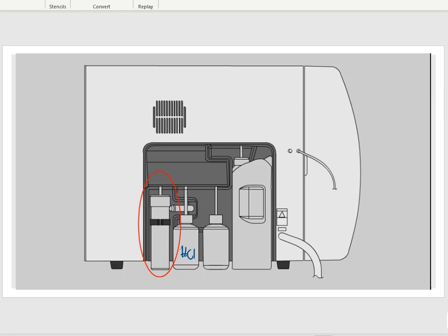So for instance, this could be my hydrochloric acid bottle that the TOC uses to squirt in my sample to ensure that the release of the CO2 is going to go forward. And beside that, you're going to see another tube, typically fairly tall, with a plastic rubbery type of lid on the top of it. And on the side, you'll see a drain arm, and I'm coloring that in blue on the screen for you. All right, so this is the drain arm, and that is where all of the extra moisture will eventually leave out of the drain pot and go into a waste bucket that's hopefully down below.